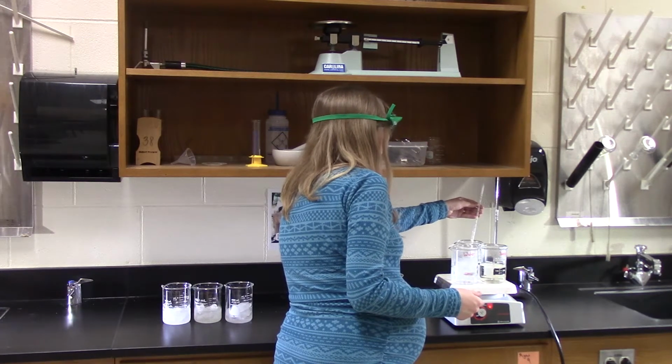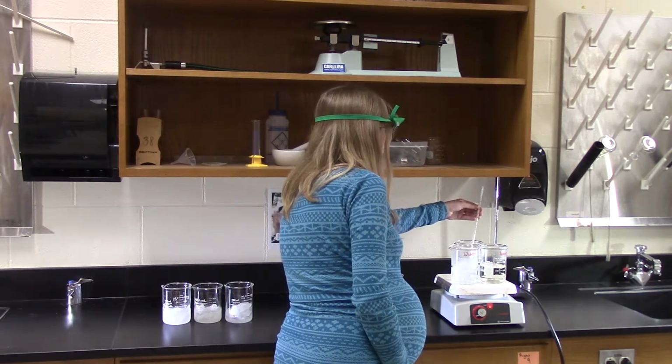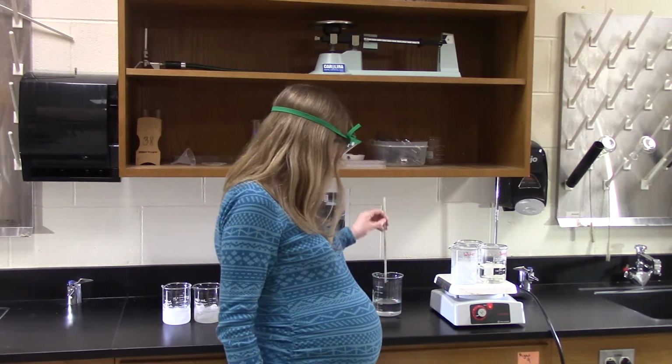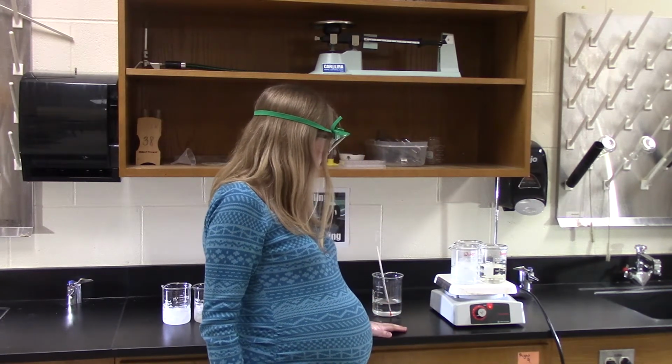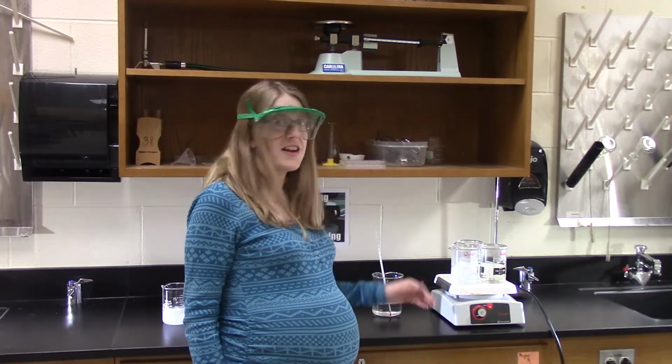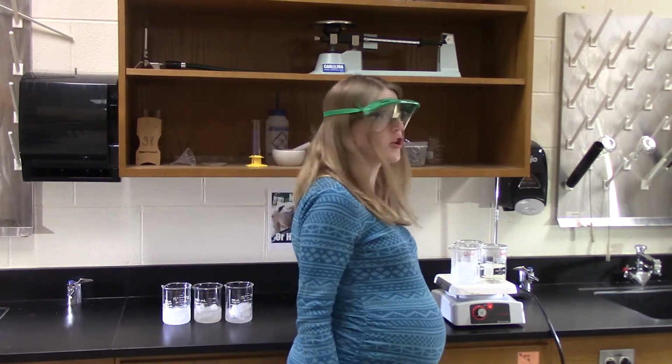Oh yeah, and we're seeing 104, 104 degrees. That's actually a pretty big difference considering usually I don't see that big of a difference in the boiling points. It's usually the melting points where I see some bigger differences. So there we go, the water boiled at 99. When we added the sugar, it did increase the boiling point by a little bit.